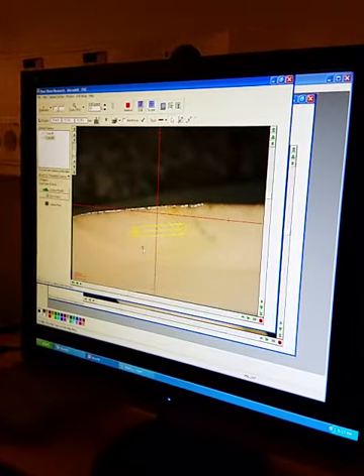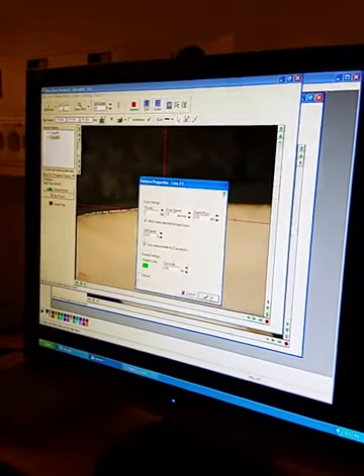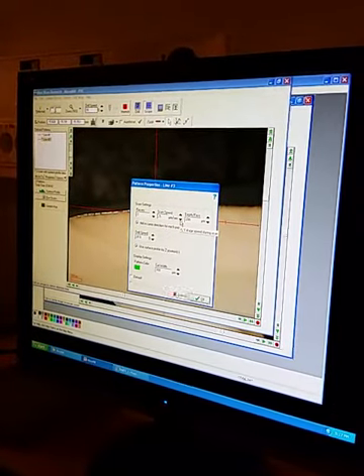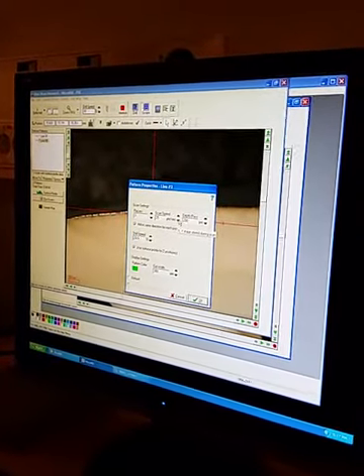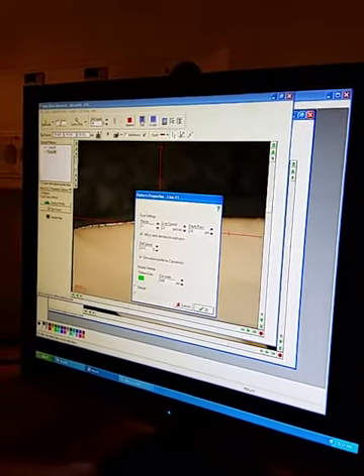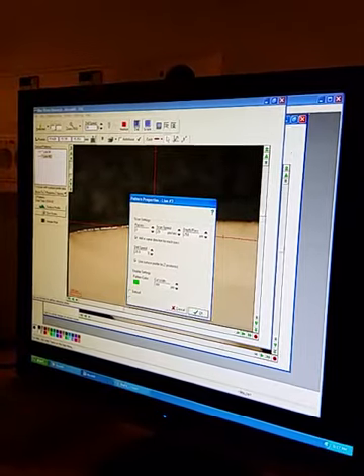So here's a single scan, 300 micron bit. Here's the properties. We're going to do 3 passes. What did we drop it down to last time? 20. Yes, 20 was the scan speed. 250 was the depth. Oops, 250 is the depth.